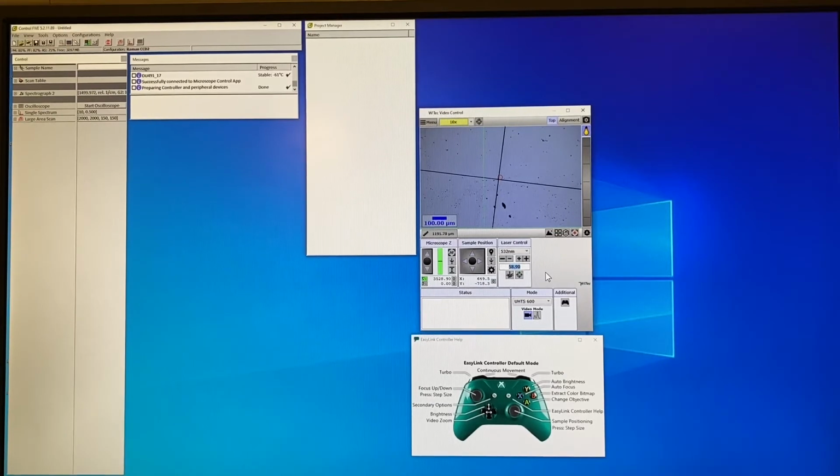So we will start with 20 milliwatt. Just type in the number and press enter to confirm. Hear the sound while the laser is changing its grating.